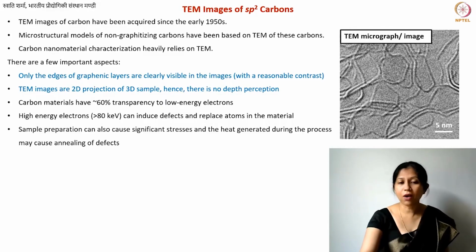Okay. So now I'll show you how a transmission electron micrograph looks. Micrograph is the term that we use often. You can also just call it a TEM image. So this is one example of one carbon material. This is how it looks.